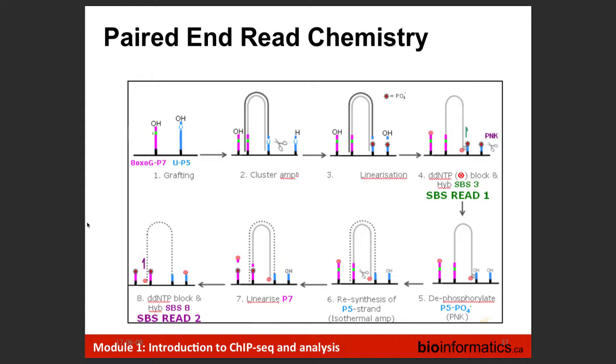When you use a mouse strain which is not the reference, of course you would expect that. Sure, it would allow a little bit more freedom for reads because you know that there are variations in your sequence. So, as somebody managing the money, it's important to know the difference in the level of information and how paired-end versus single-end enhances your data set. There is quite a price difference between single-end and paired-end. There is, but it's not double, right?